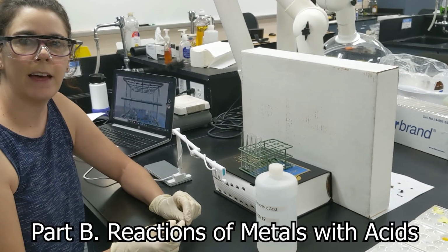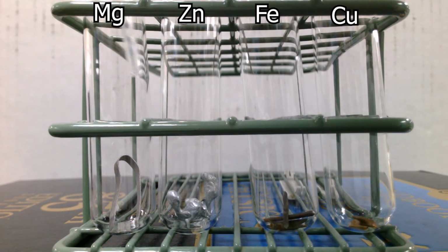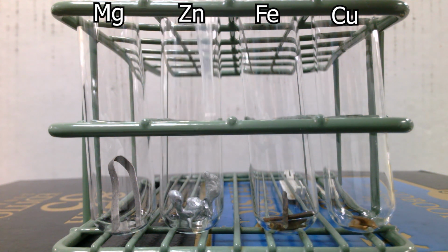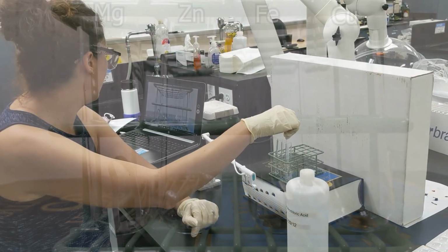In part B of the lab, we are looking at the reaction of different metals with acids. So in this first test tube here, we have our magnesium metal. Next in this one, we have our zinc. Third here, we have iron metal. And then this fourth one here, we have our copper.